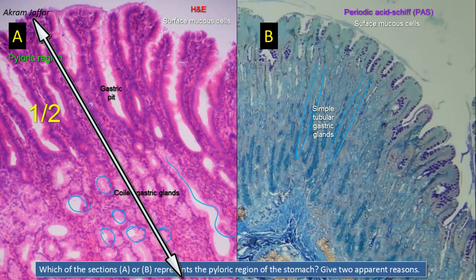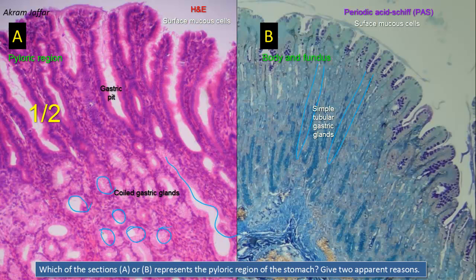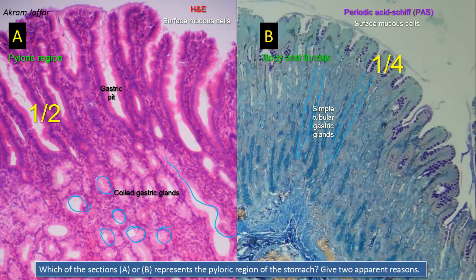The pits in the pyloric region are deeper than those present in B, which is the body and fundus of the stomach. The pyloric glands open into deep pits, and the presence of these deep pits gives the superficial mucosa a characteristic frond-like appearance in histological sections. The gastric pits in the fundus or body occupy about one quarter of the thickness of the gastric mucosa. Also note that in section A, the pyloric glands are lined almost exclusively by mucus-secreting cells, and there is a very small number of parietal cells, characterized by their fried egg appearance, in the pyloric region.